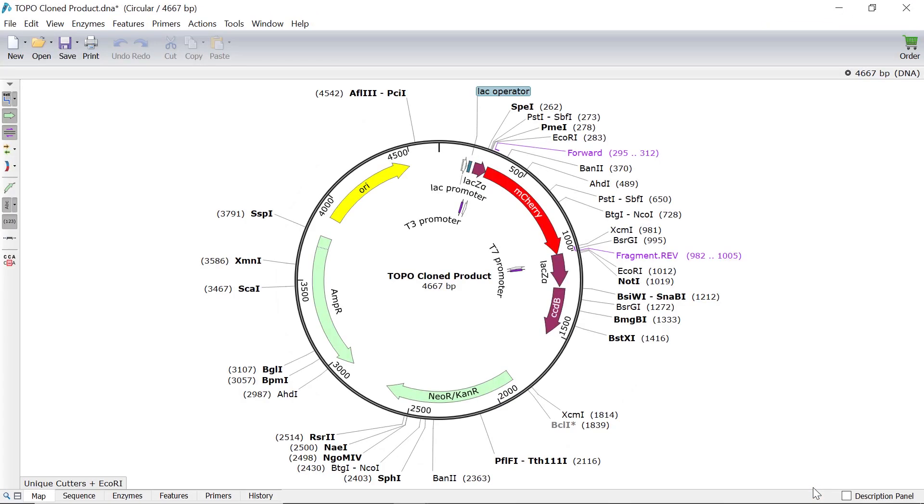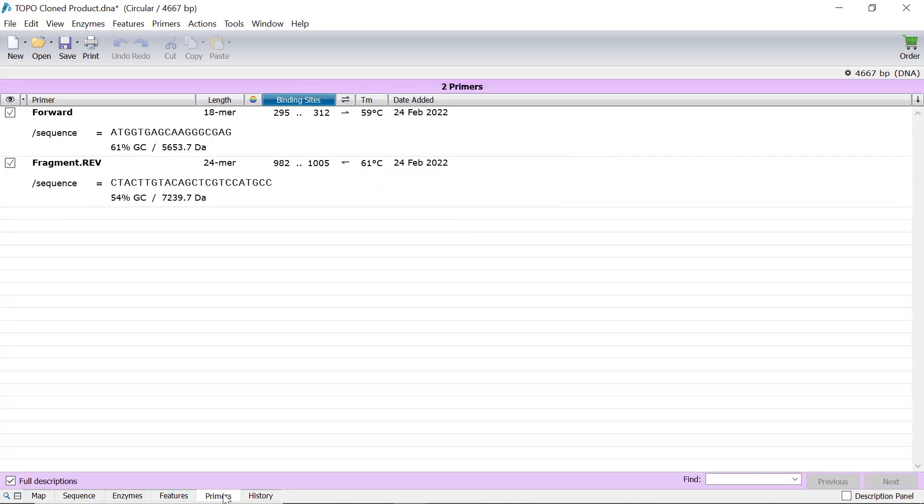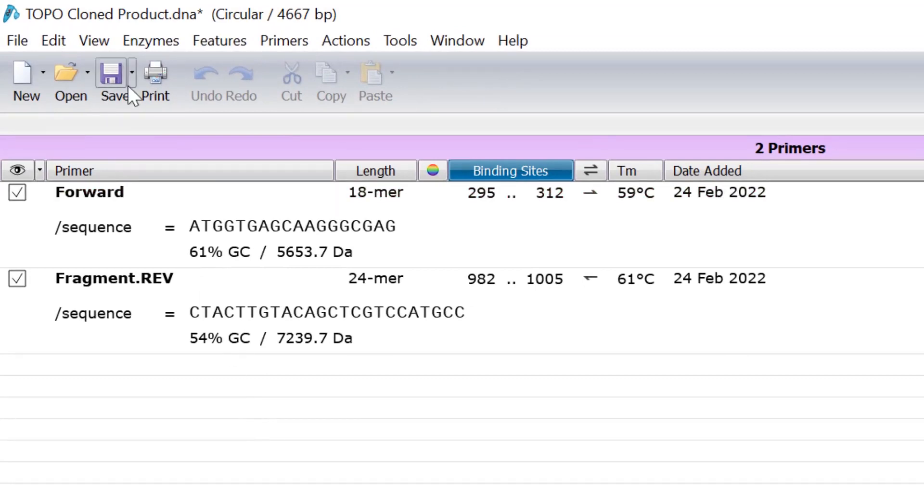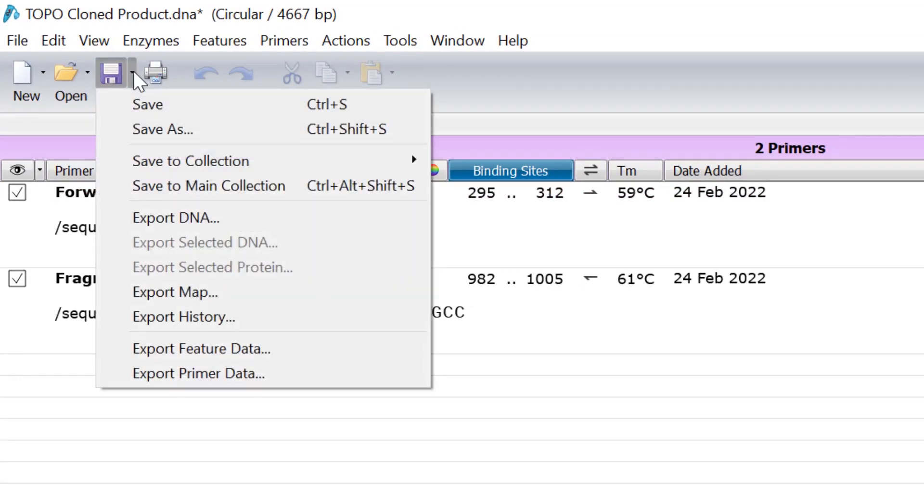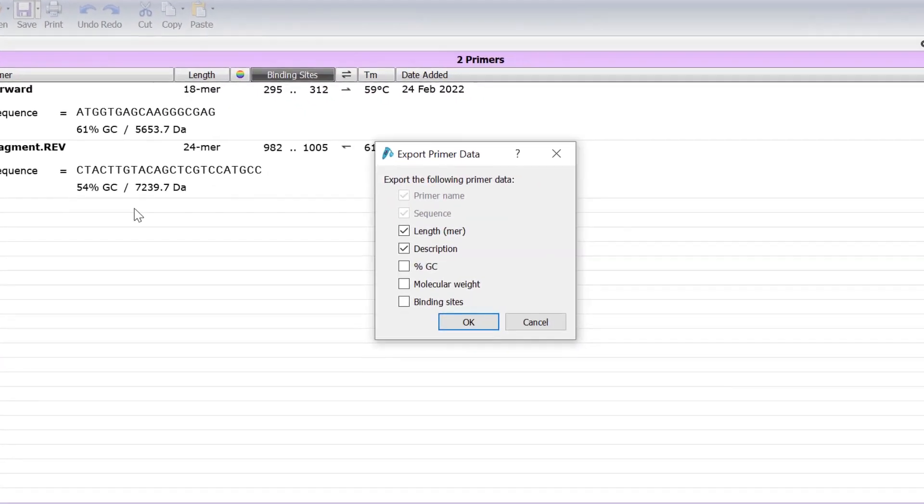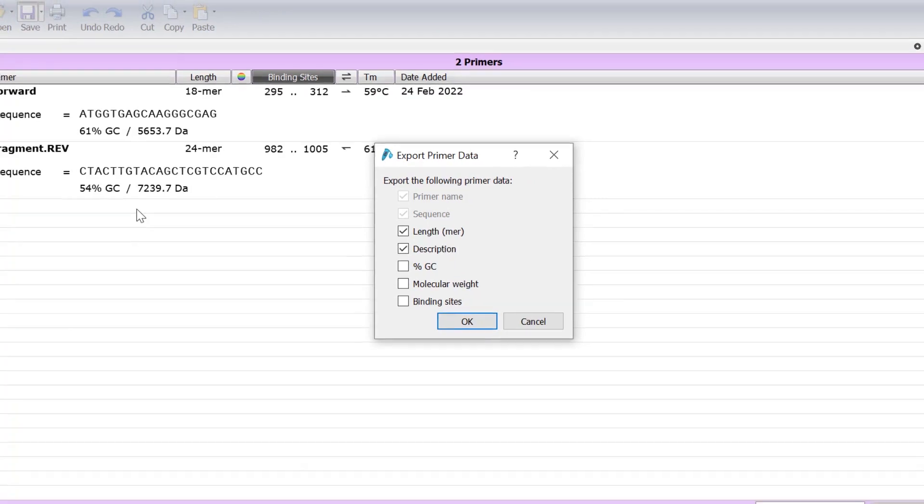Snapgene will open a separate product file along with a PCR fragment and alternative product file if you selected to have them. Switch to the primers tab to view the primer sequences for this cloning process. Select the down arrow next to the save button and choose export primer data to export these sequences for easy ordering.